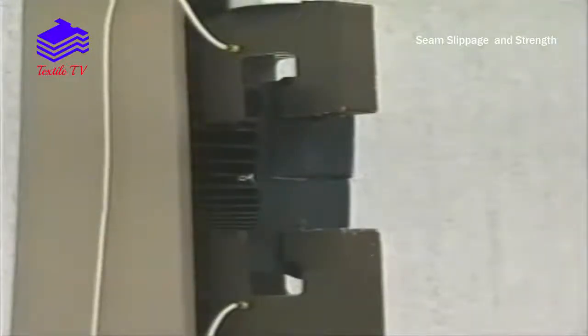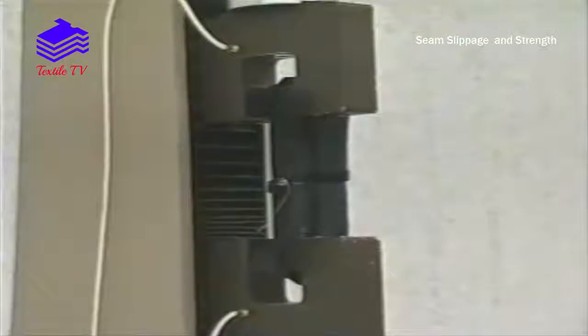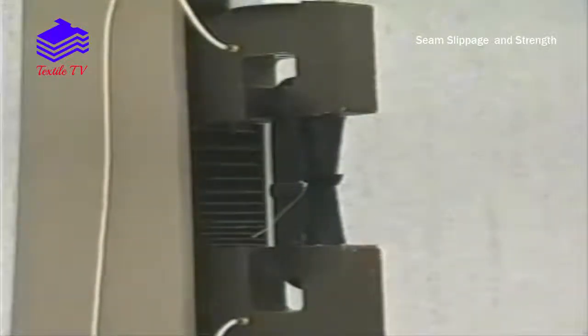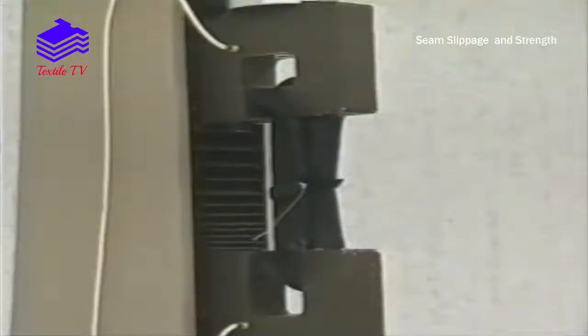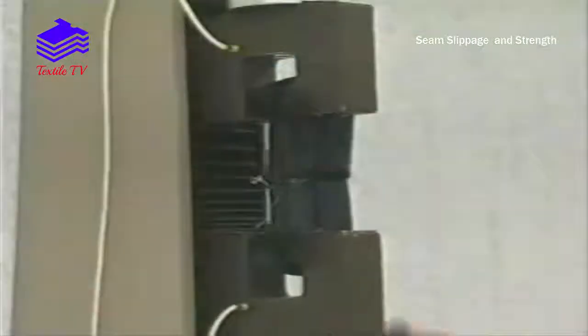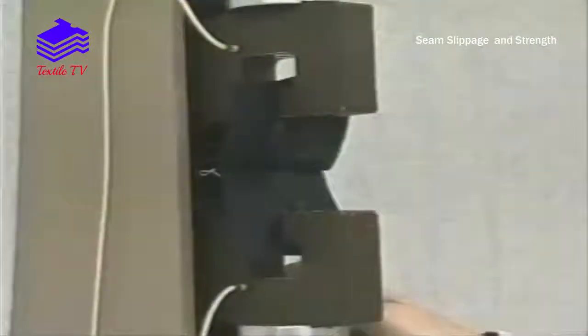The seam properties of a garment made from woven fabric are determined by using a tensile testing machine which is capable of applying a constant load at a constant rate of extension and recording the load at which a seam opens to a given amount and the final breakdown of the seam.